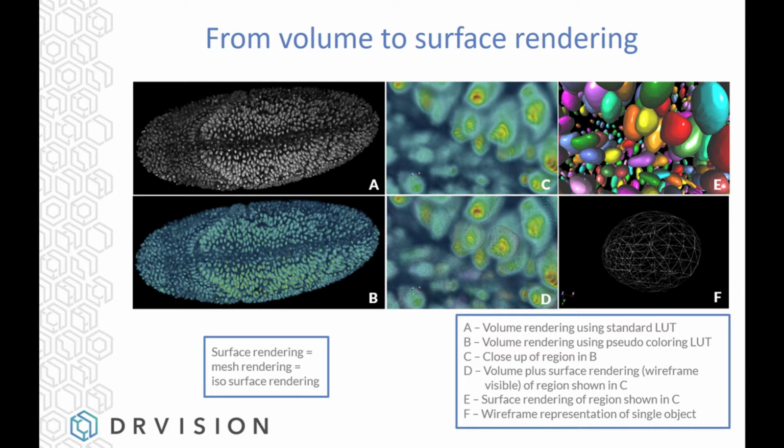And if you take those pixels and you know what the depth of each pixel is, you have then a number of voxels, and because you have their 3D coordinates, you can plot them in 3D and give them the right intensity value. And that's what A is.